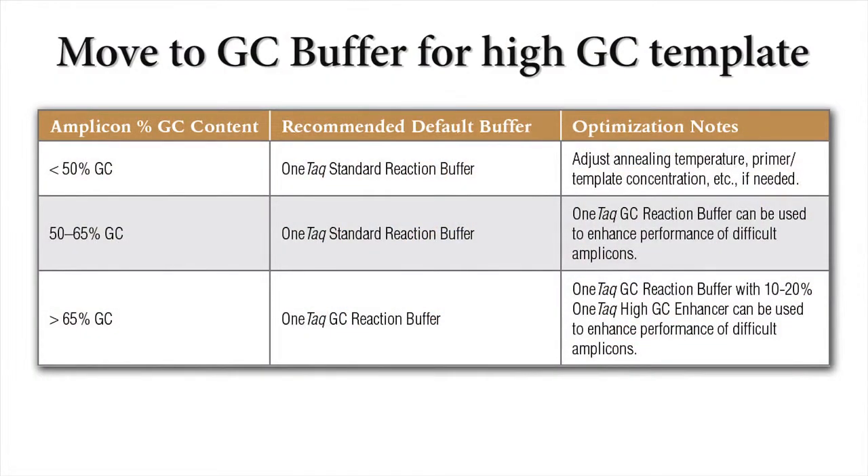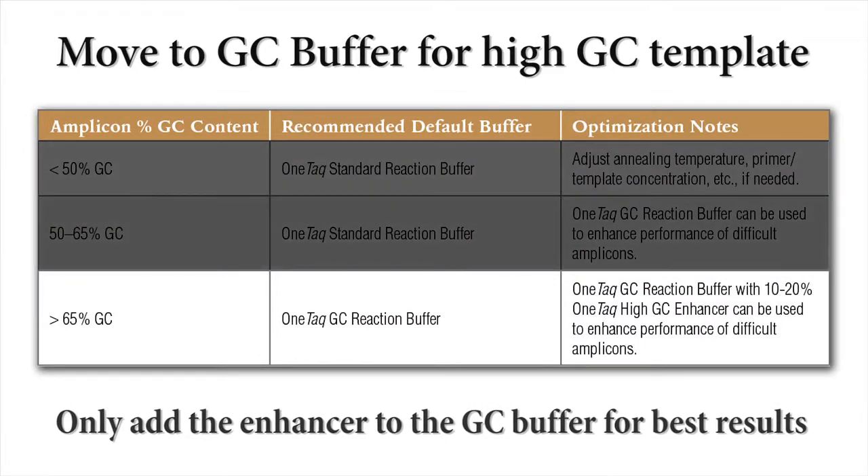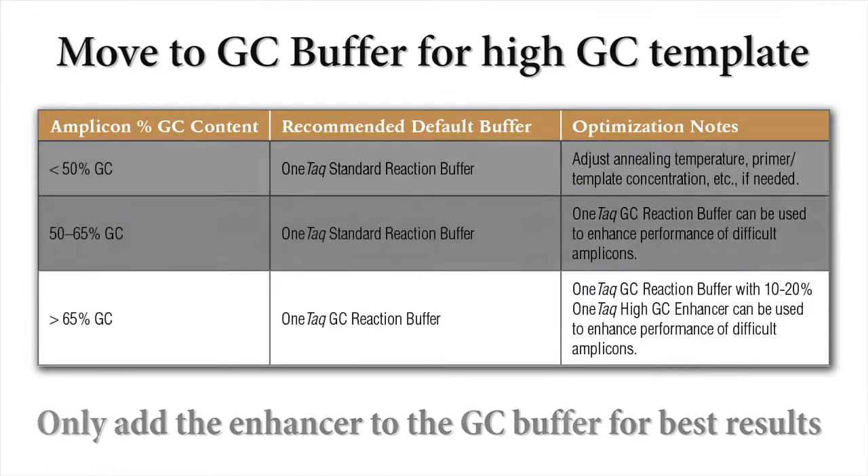In our experience, we find it's best to start with the standard reaction buffer, then move to the GC buffer if you know your template is high-GC. Please remember, only add the GC enhancer to the GC buffer, not the standard reaction buffer.